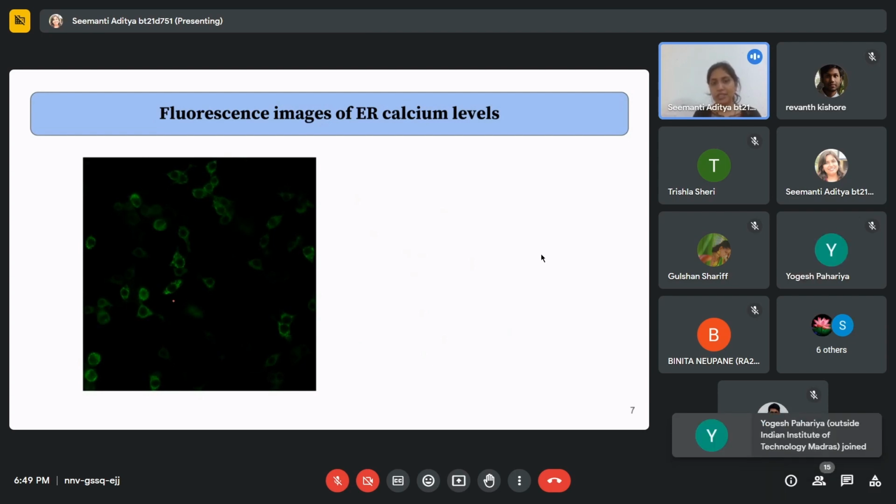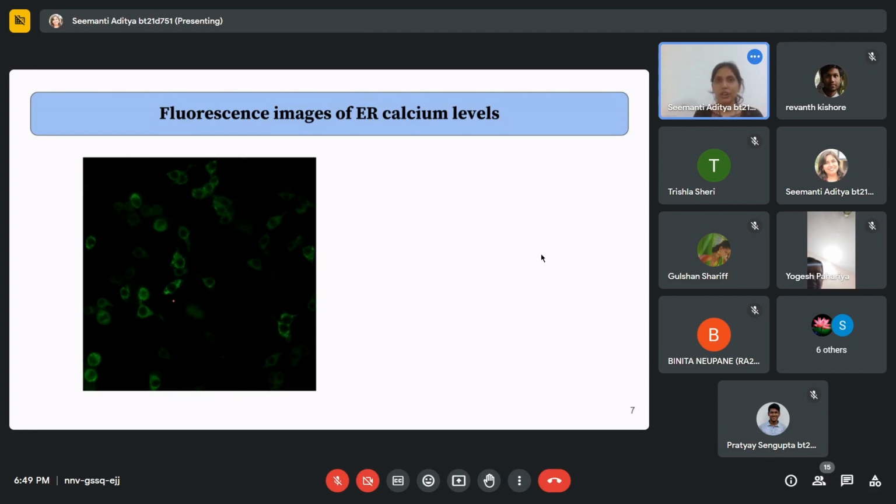Apart from just taking snapshots or pictures, even some microscopes are capable of taking time lapse images. Depending upon your requirements, obviously not all labs require time lapse images, because some labs are okay with showing the snapshot, not what is happening over a period of time.